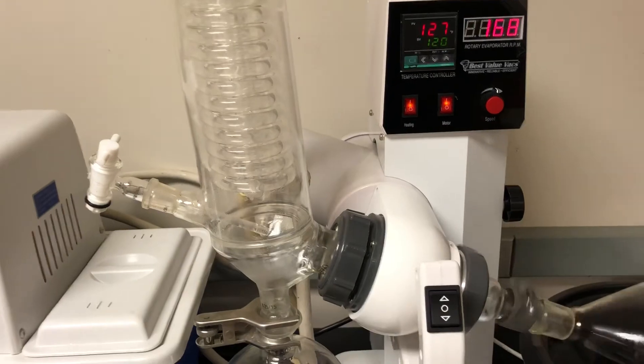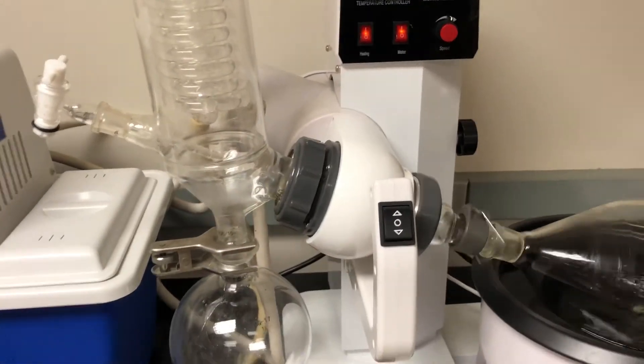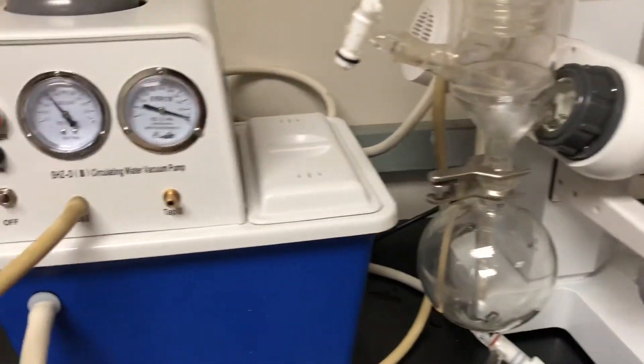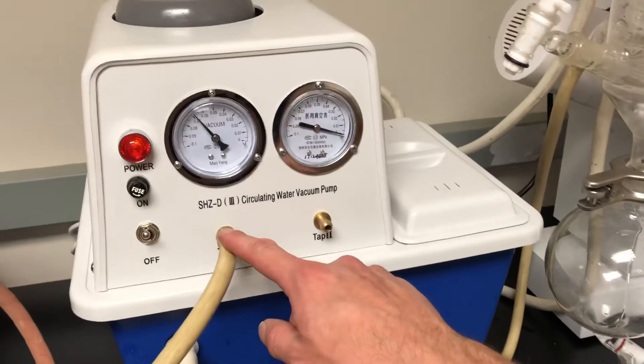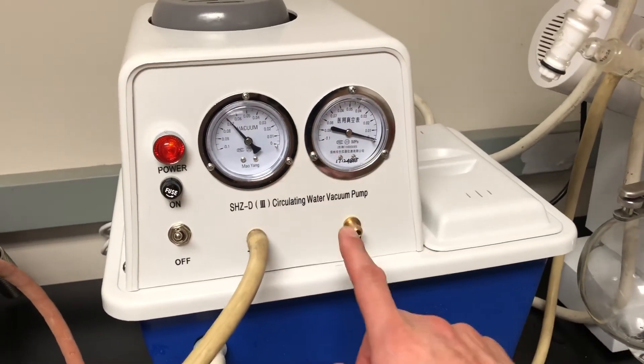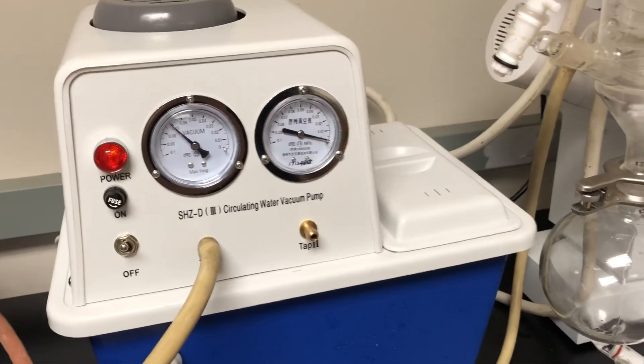We are running now so we got a little bit of chilling going on. We got a little bit of dripping. I'll let this go here for a second. I'll show you guys a close-up of this. As you can see, you got your vacuum on this side. It's the one I'm using. This one, if you were to close it, you can see it will go straight up.